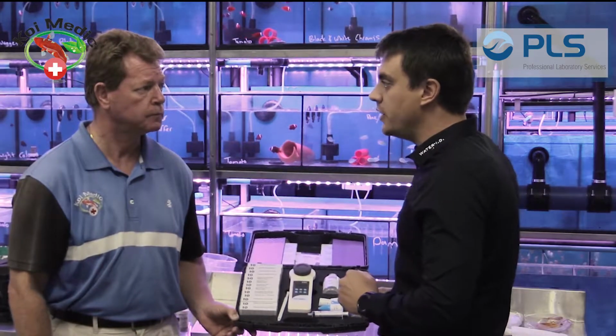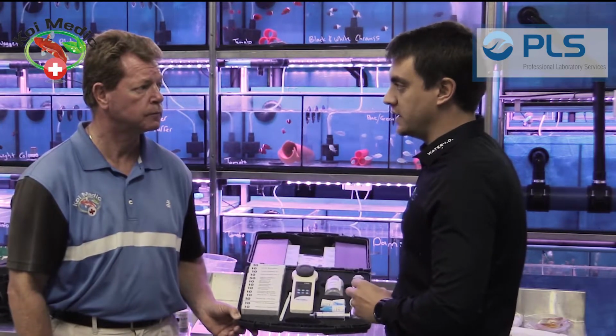You can actually set it up for each type of water you're testing. You go into your settings, you say, today I'm testing my marine water, you set it on marine, and you go ahead with your testing. If you're testing the next day your pond water or fresh water, you can just set the settings to pond or fresh, and go on with your testing.